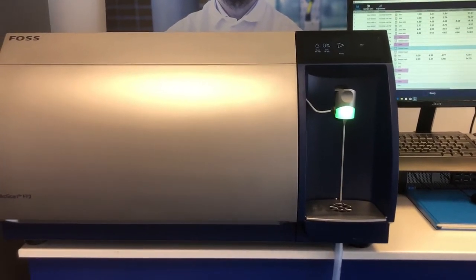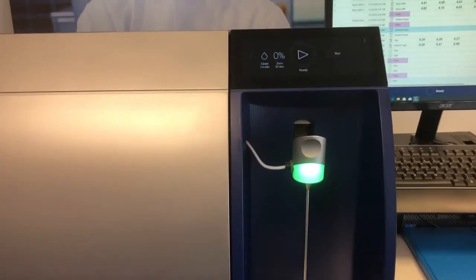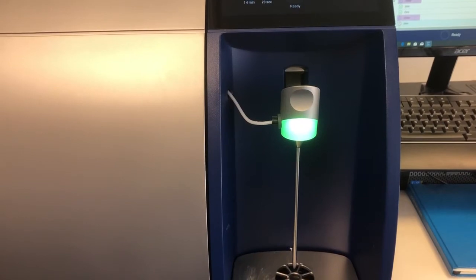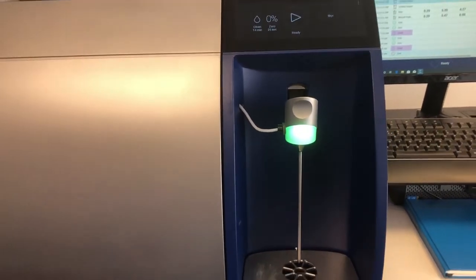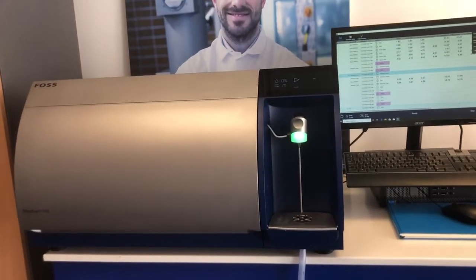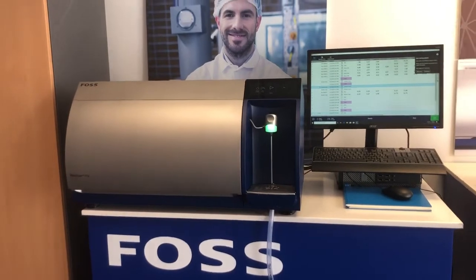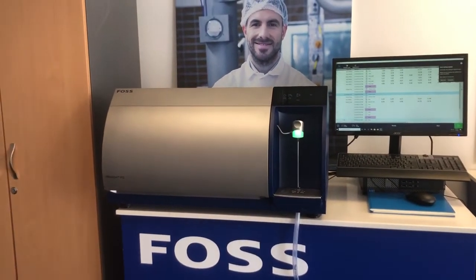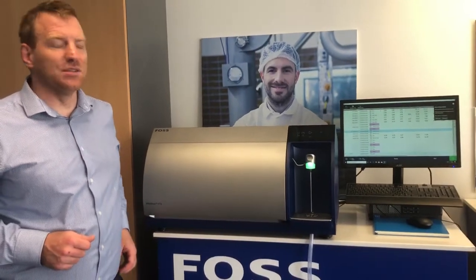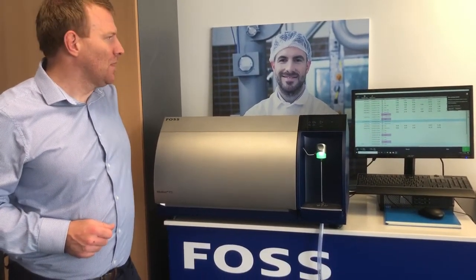We have a variety of calibrations. The instrument comes as standard with a basic milk, cream, and whey calibration. Additional calibrations are available for yogurt and fermented products, formulated and fortified milks, concentrated milks, whey products, an adulteration screening module, and ice creams and desserts for the really thick products.